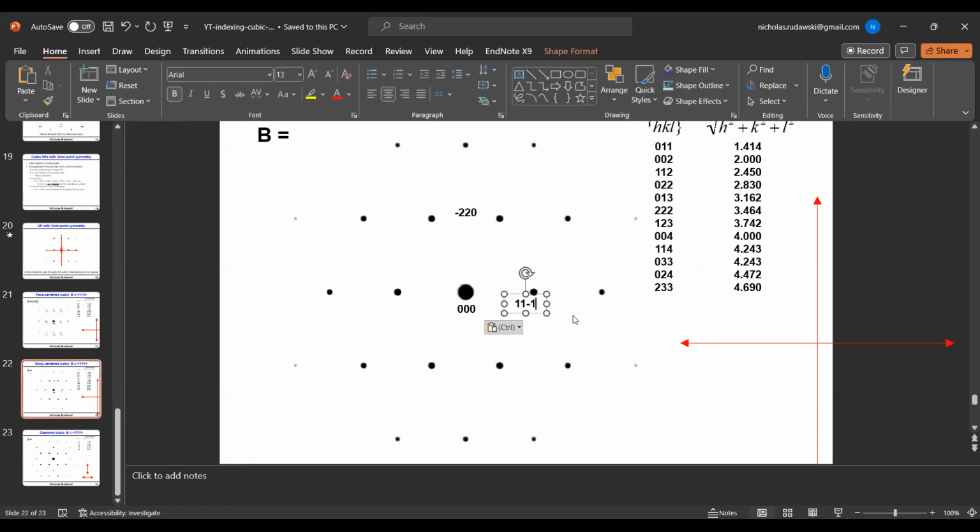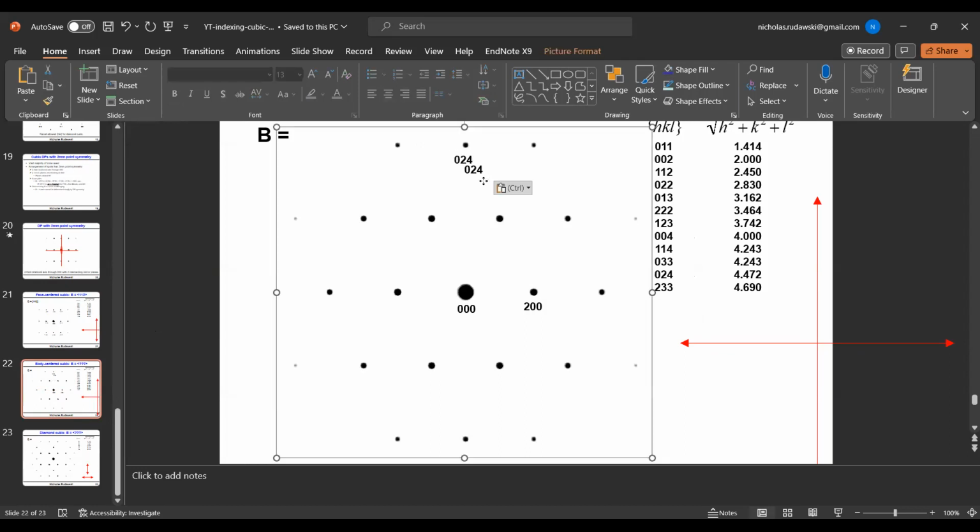Okay, so we end up with the closest, that is 2, 0, 0 and 0, 2, 4.